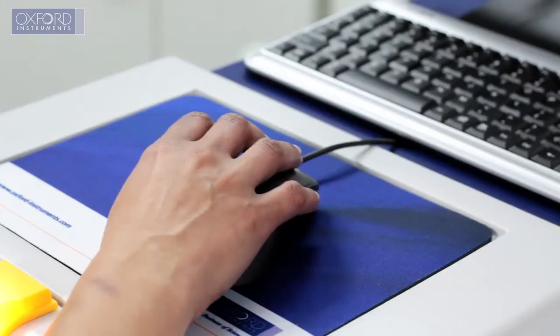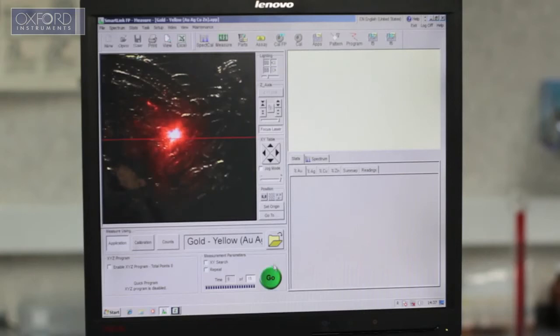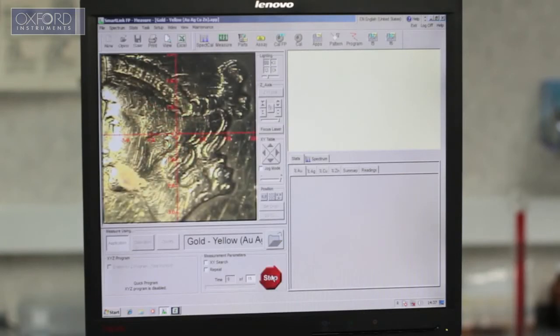When all measurement points have been defined, simply press go to start the analysis.